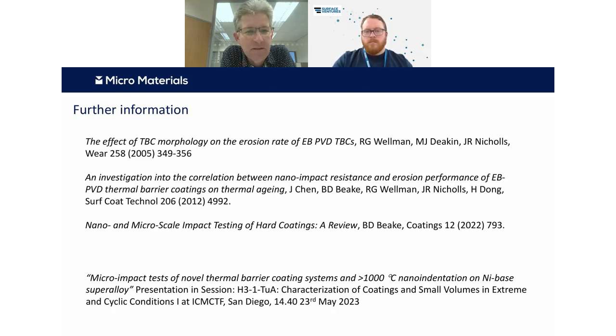Typically you want your test to be able to start moving into these more fracture modes, and you're more likely to get those for the Gaussian distributions. No, I think that answered it very well. Like you say, it's a new test technique, and it's still sort of defining some of the parameters for that.